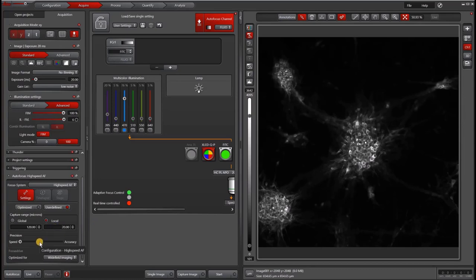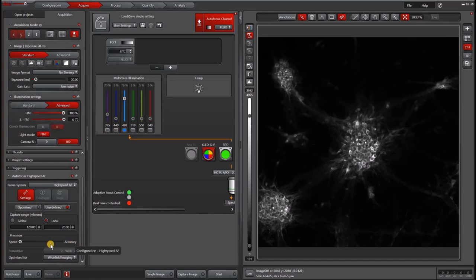For the precision, high speed means fewer Z slices and high accuracy means more Z slices. So usually I go with something in the middle and that gives me a good result.